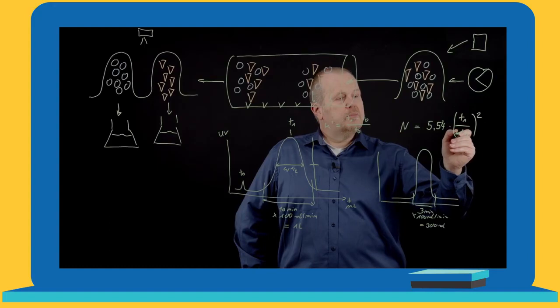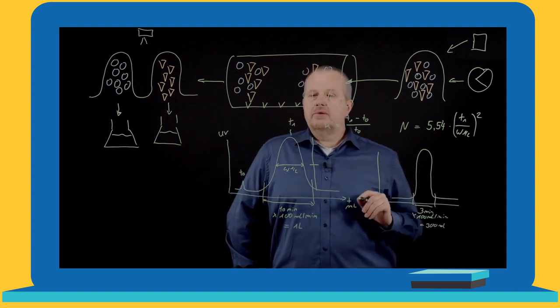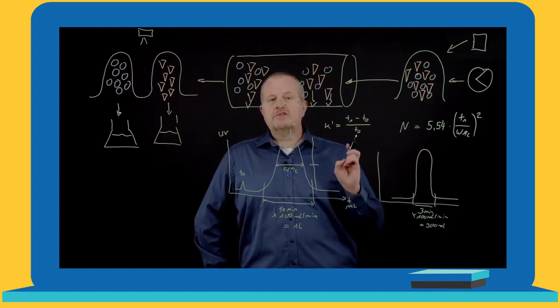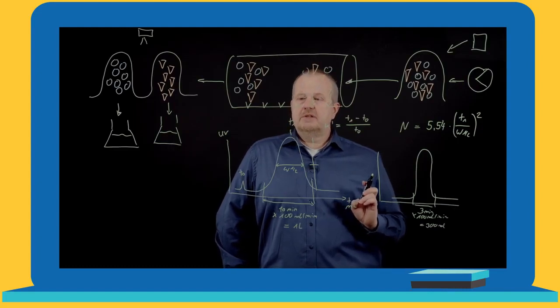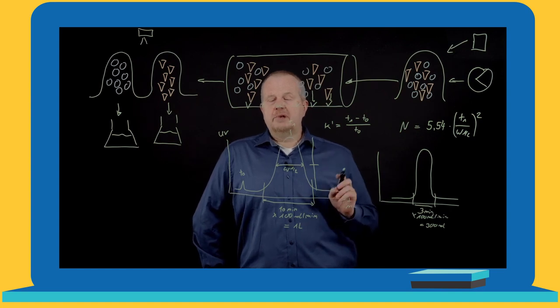So the higher this number, the more efficient your chromatographic system is. And you see, the smaller the peak width, the higher this plate number. So how do we manage to have a chromatographic peak which has a small peak width and a high efficiency? The magic for that lies in the chromatographic bead. And that is the next point we will have a look at.